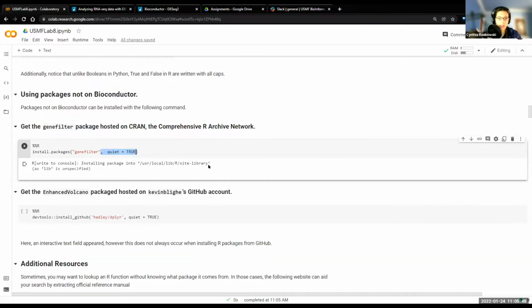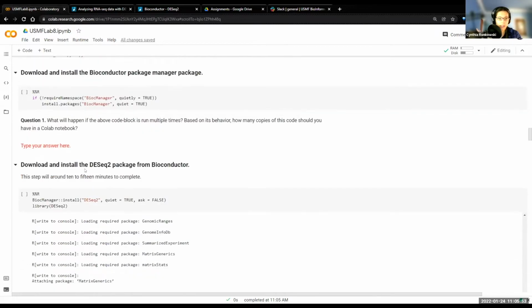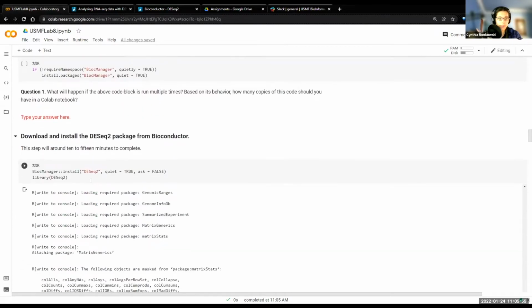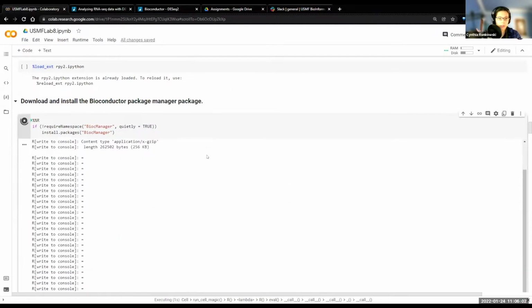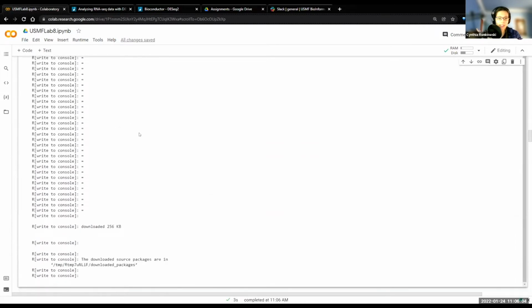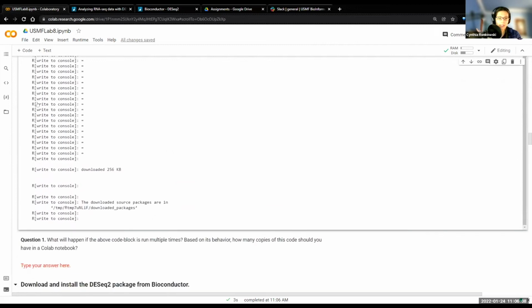Okay, that one's fine, I guess, but if I scroll down and move this, for example, then you'll see it just continues to output lots and lots of text.